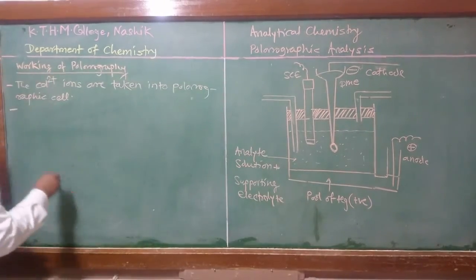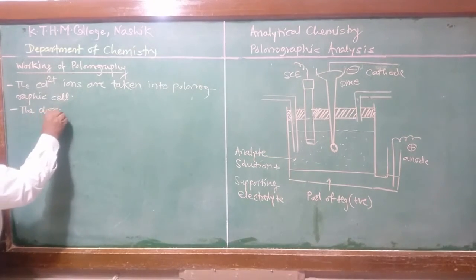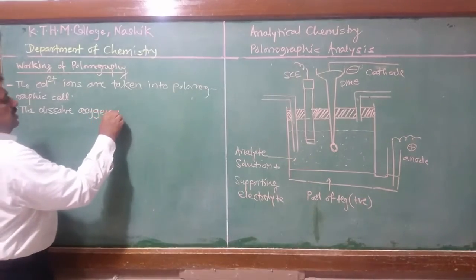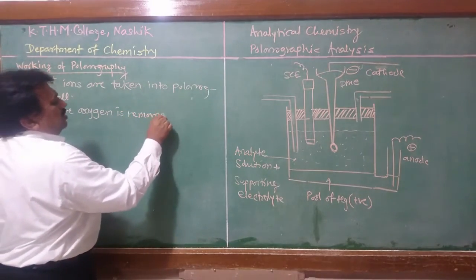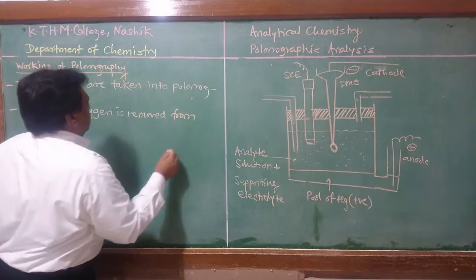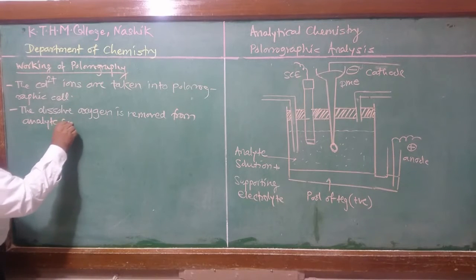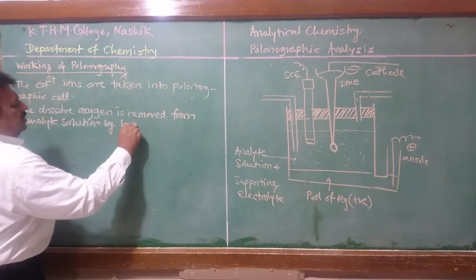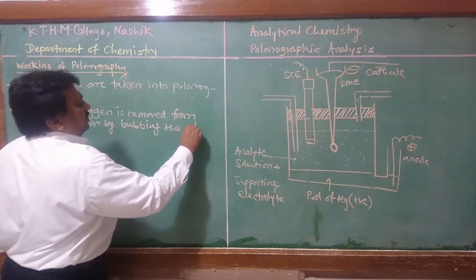Therefore, the dissolved oxygen is removed from the analyte solution by bubbling the nitrogen gas.